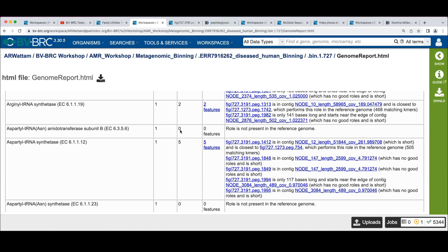But here's another, a different case where this particular protein, we were predicted to have one, but it was not found. But it also says that the role was not present in the reference genome, which is a little funny, right?